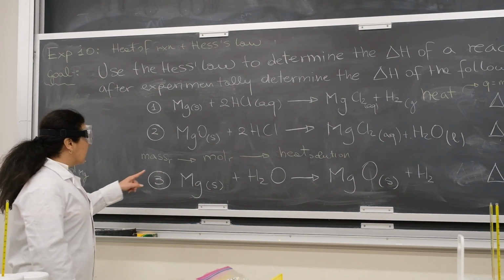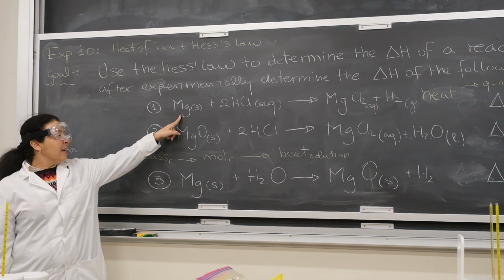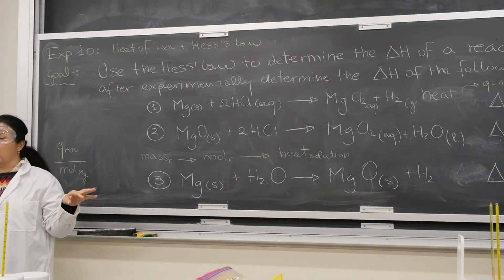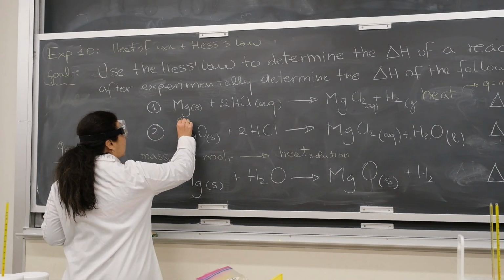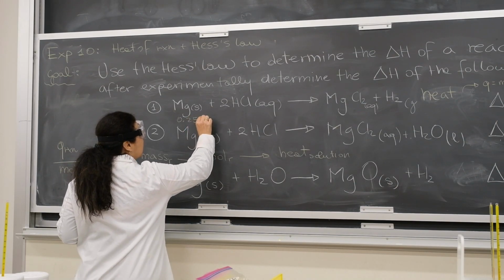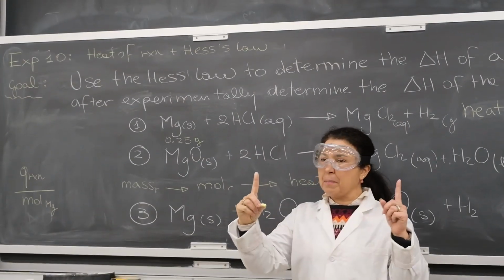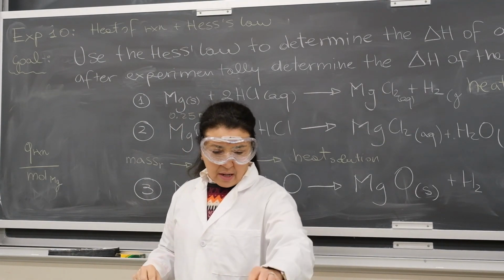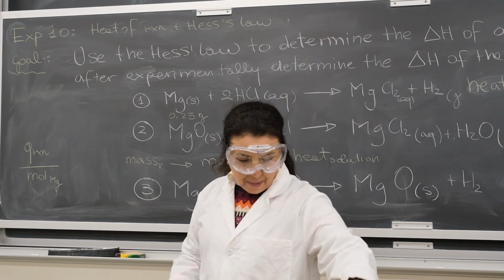And how do we get the moles? From the mass that we weighed. We are using the analytical balance to measure the magnesium. Now, the magnesium that you had to weigh is not what is written in your lab manual. That is incorrect. You need to weigh approximately 0.25 grams of magnesium, or a strip of 15 centimeters. So here is the ruler. Please start by using the magnesium that is already chopped up.